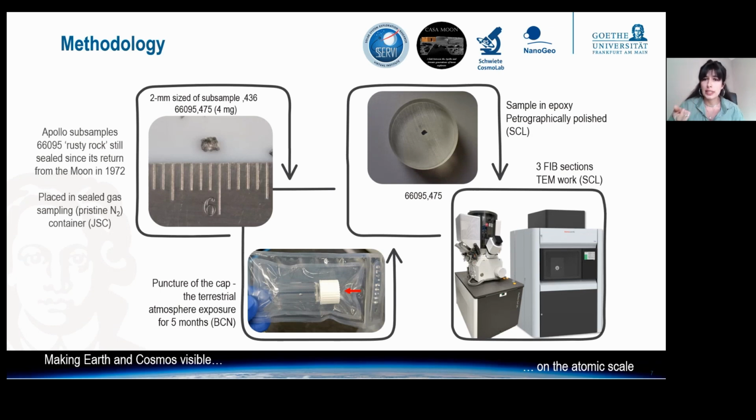Then we opened the sample and let it interact for a couple of months, and we repeated the analysis in the synchrotron. Once the sample was open, we placed it in epoxy and prepared 3 FIB sections that we studied by TEM.